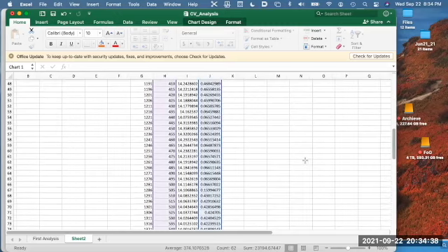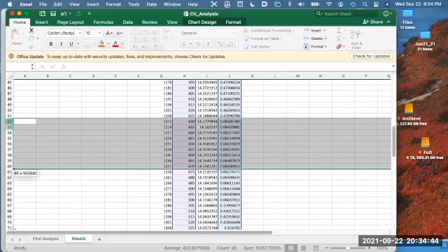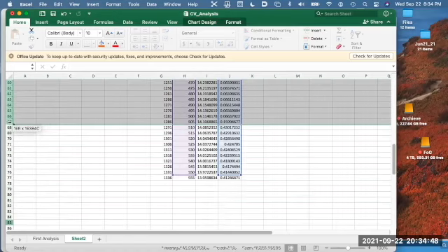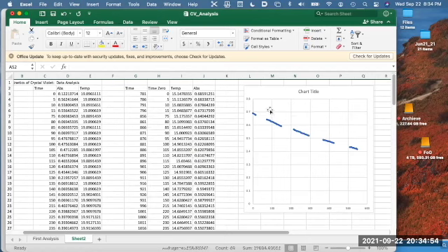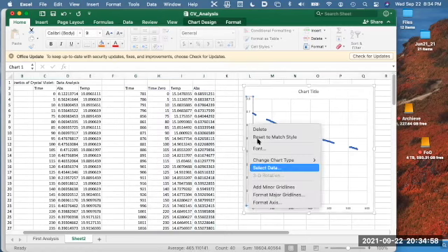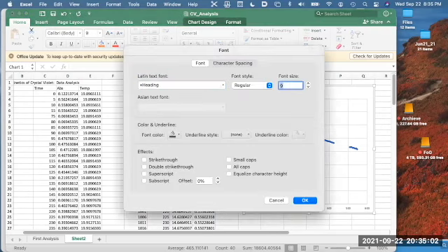And again, it's just a matter of looking at the data set in which the absorbance drops. And when that's all said and done, you'll see that the absorbance that is less than 0.3 has been deleted.